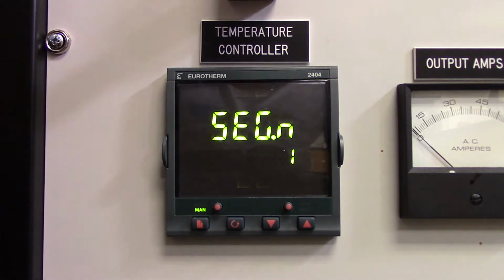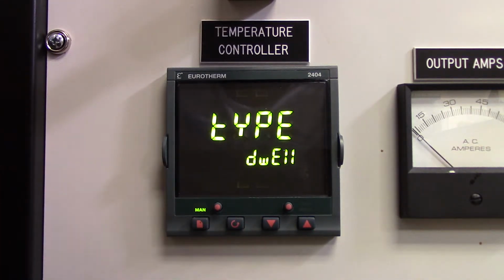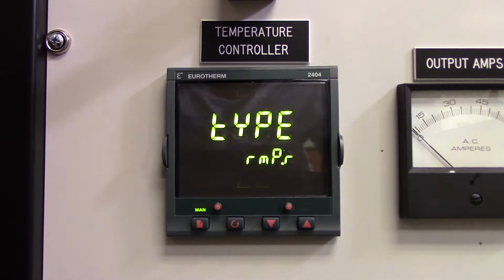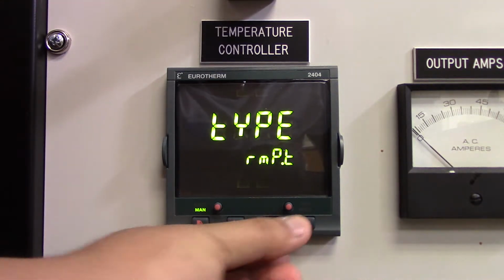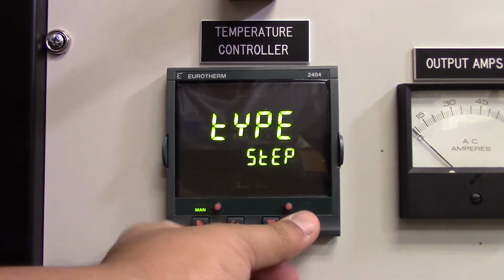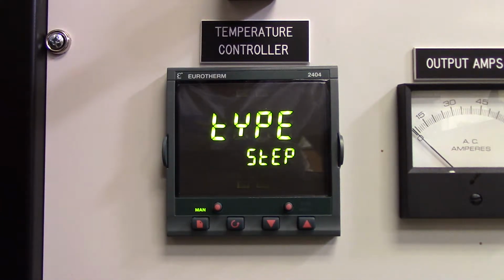And here we are in the segment menu. Each program is divided into segments that determine if the program will raise, lower, or hold the temperature. Let's just go through here. We see the different mechanisms they have here: ramp rate, to bring the temperature up at a given rate; ramp time, to bring the temperature up within a given time; dwell, to have the system maintain that temperature; step, to set it at a target temperature; call, to reference another program; and end, to end the program.